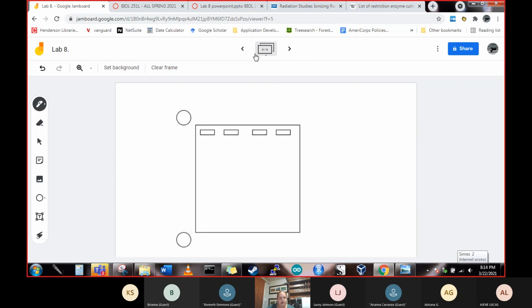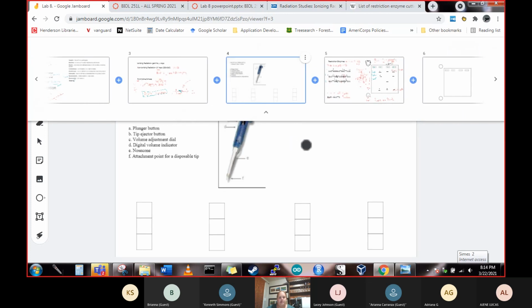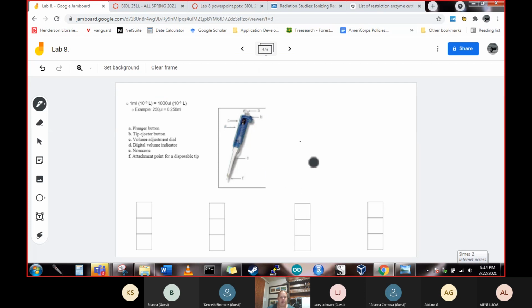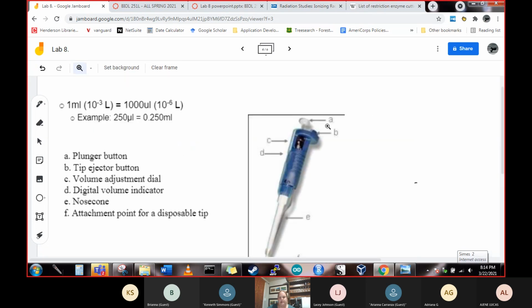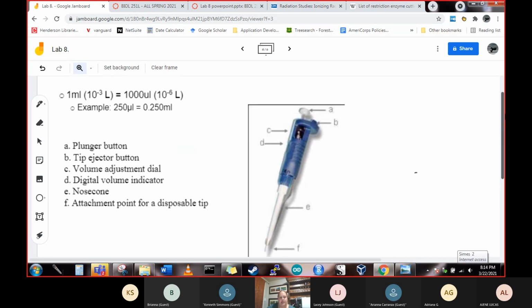And this was just a blank electrophoresis gel that I did. Okay, so I could draw some of that on a different page, which we didn't do. So I'm going to go back now to our final topic, which was pipetting. I know you guys have hit on this a little bit already, just throughout our various labs, but I definitely wanted to focus on this a little bit. This is the slide that's in James's PowerPoint. Definitely understand what these different points are on a pipetter.